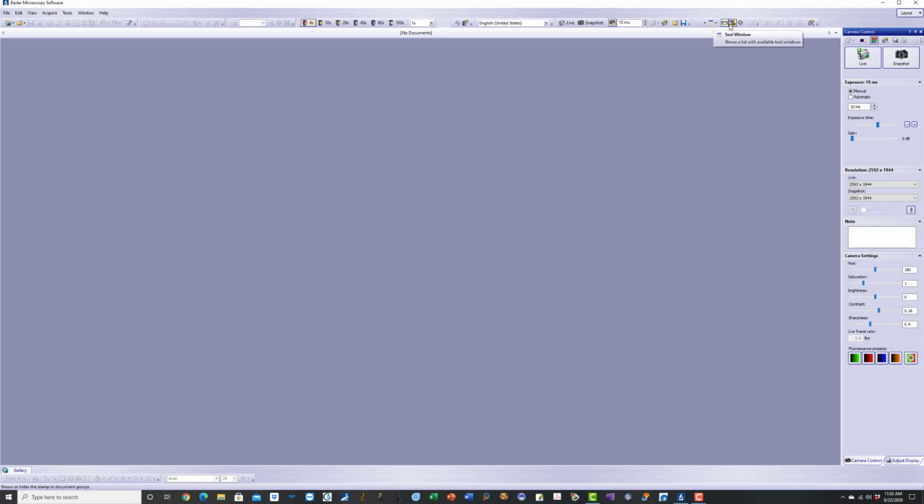Toolbar, tool window, scale bar, info stamp, crosshair. If you want to give a crosshair on your sample, usually when we do the air void analysis, we need the crosshair. Maximize to screen, select measurement object, arbitrary line, 3-point angle, closed polygon, select measurement. So these are different tool options present.